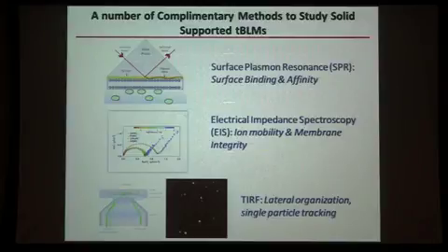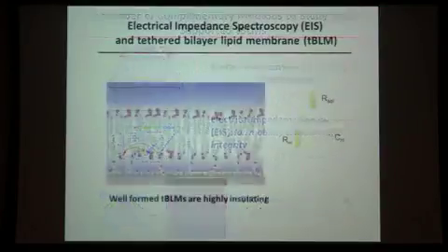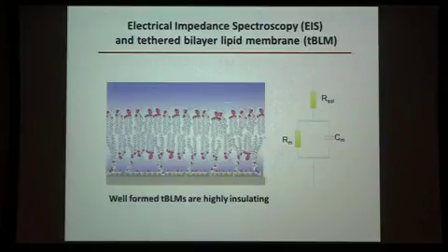Go into that today. Today, I wanted to just highlight an instrument that's been built in the lab to look at these two technologies as a rapid way to screen the bilayers for different conditions as we optimize our bilayers for the more sophisticated structural measurements.